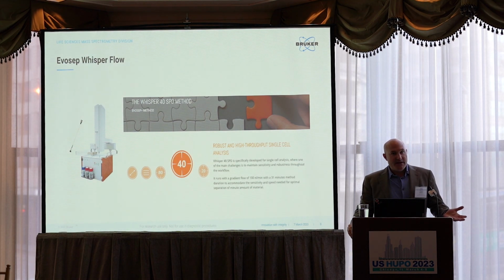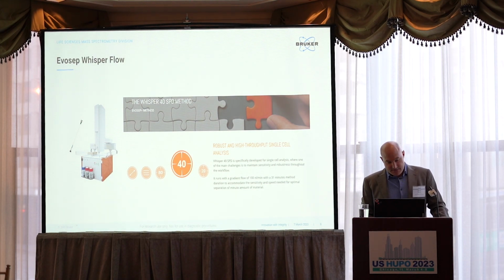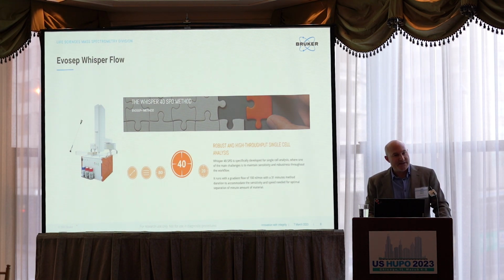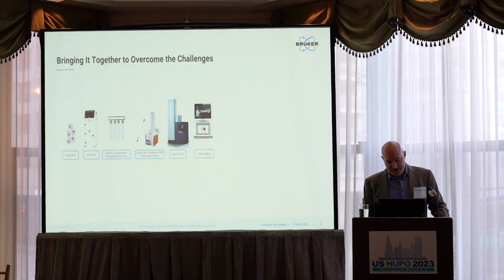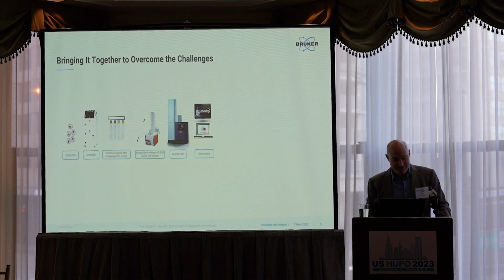They have now extended to different methods, including an 80 sample per day, as well as you can go very slow at 20 samples per day. It's funny that I say 20 samples per day is slow. Five years ago, I would have just thought that's normal, but that's very slow now.